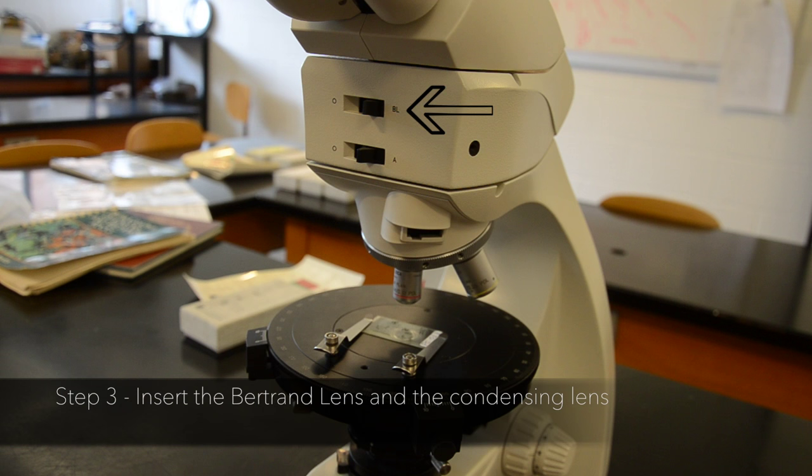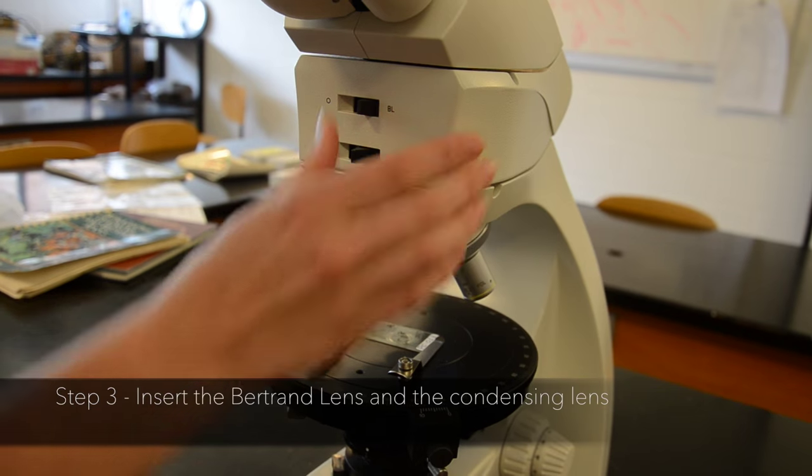Step 3. Insert the Bertrand lens and the condensing lens. For this microscope, the switch labeled BL inserts both.